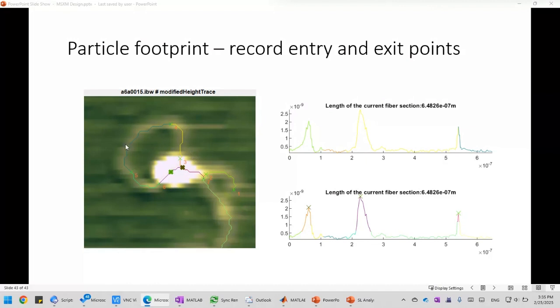So now in this example, we have the protein complex looping the DNA here, and already you can see that the entry points and the exit points are marked in this way. For example, the DNA goes from 1 to 2 to 3 to 4. That's one possible pathway of how it goes inside this protein complex.